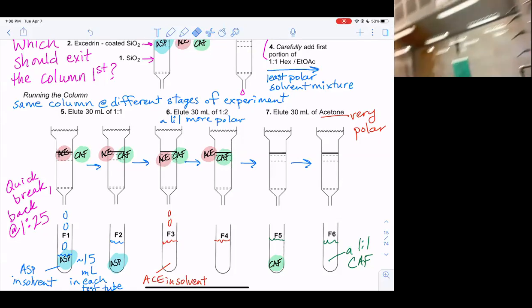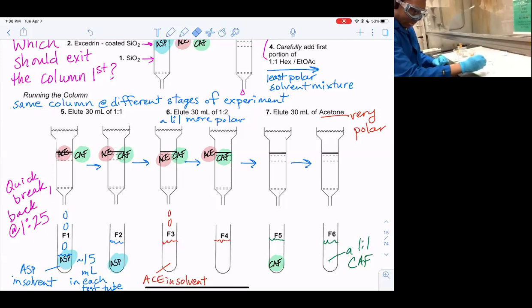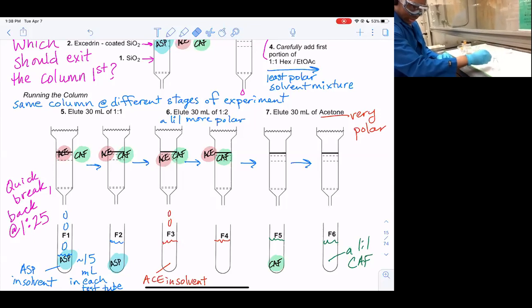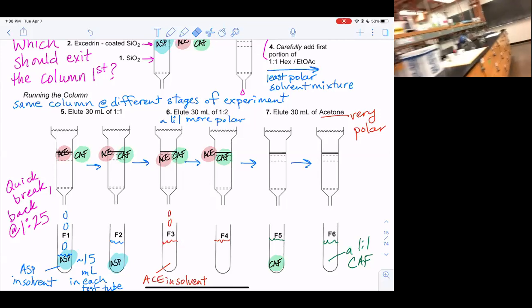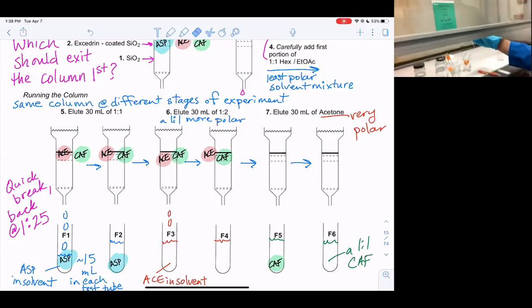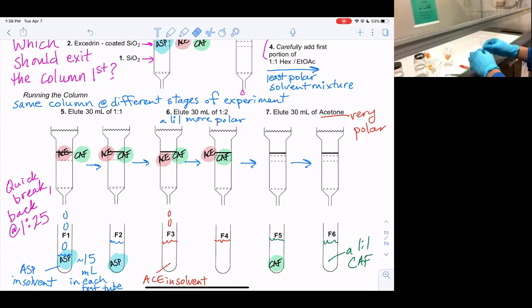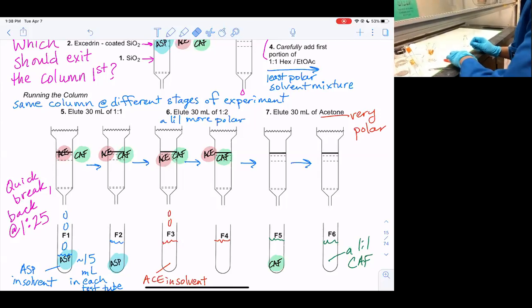So I have a capillary tube that has acetone for cleaning. I take some of that and clean up my capillary tube. So put some inside, and then you just dab it onto a Chem wipe just to make sure it's clean on the inside. There's no residual chemicals in there. So then I take some from fraction 1, just a little bit, don't need that much. And then I just dab, maybe one more dab might do it. Let it dry a little bit.